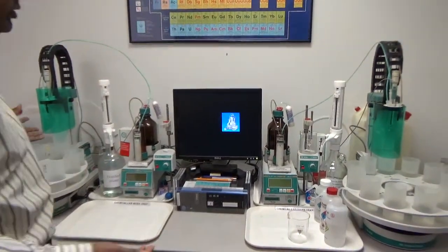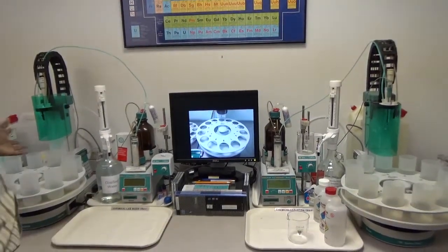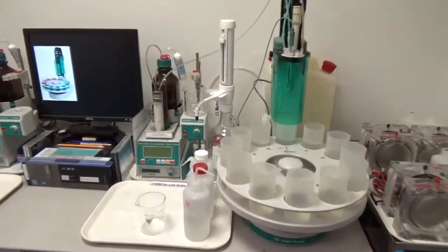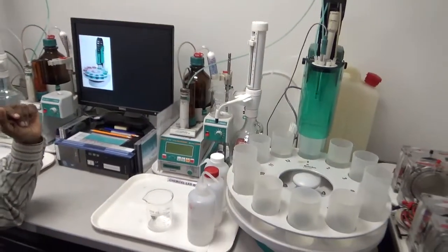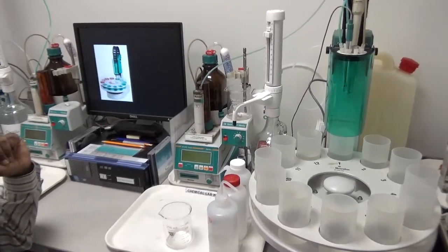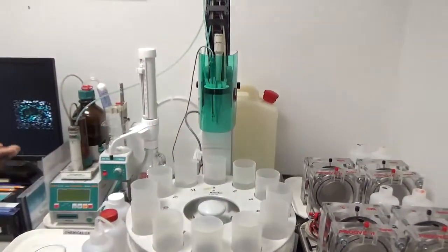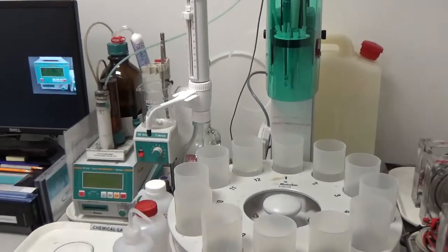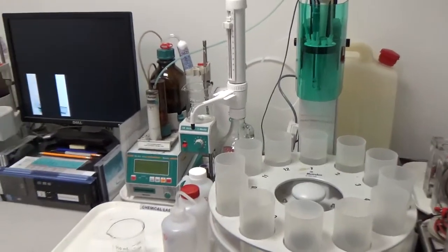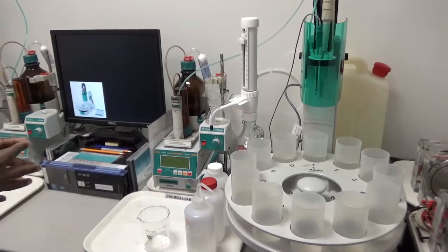I'm going to show one workstation and how we do the chloride analysis with two samples. Every time we do chloride, first we have to run a blank — we have a known amount of chloride and determine the equivalence point of titration. When we get the right equivalence point for the known amount of chloride, we know the equipment is properly calibrated.